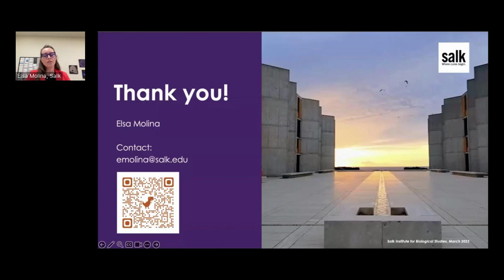For oncology, that will depend on which species. Is it directly human or mouse? We will start from the species, and then the tumor: the size of the tumor, the area, and how many samples we need to run to answer the questions. After answering all of those questions, we can define the best tool. But I think all the tools on the market right now can fit one specific need.